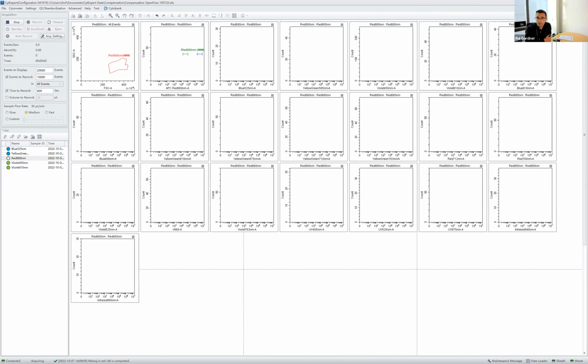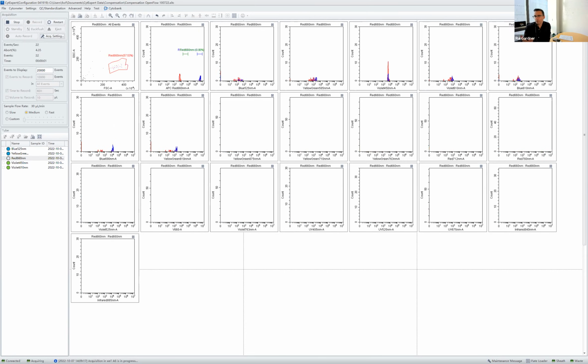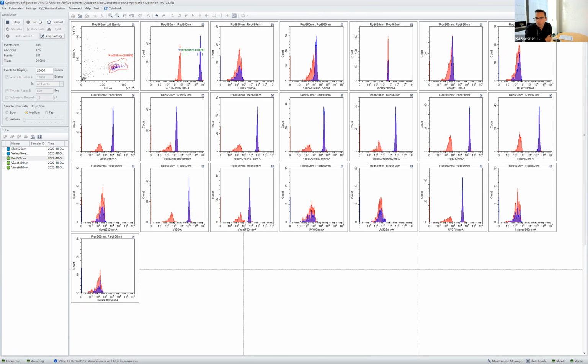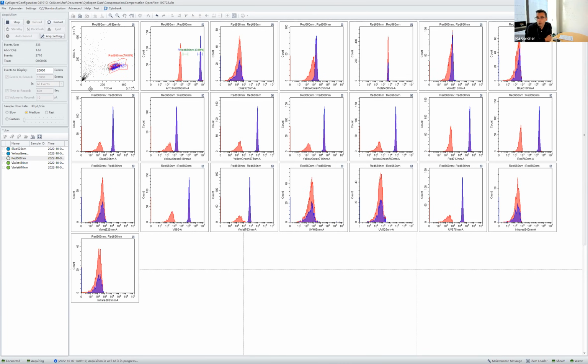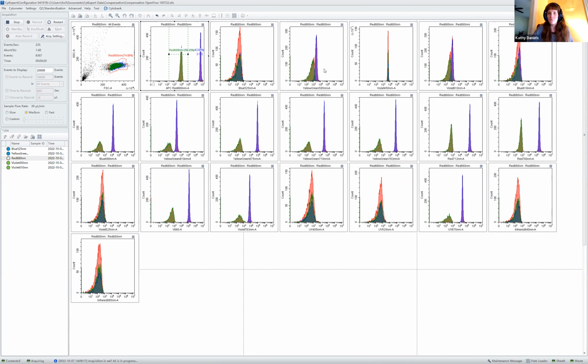Together, it means that those lasers spill over together. I mean, it's not the lasers, but the emission of the populations that are spilling over. And yes, it's showing where each of the populations will fall in the other channels. It's showing it like an overlay, which is how you visualize some data in other software, the overlay of the populations and where that shows up.